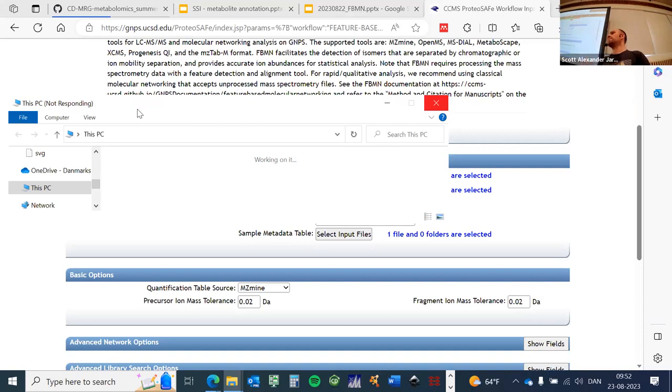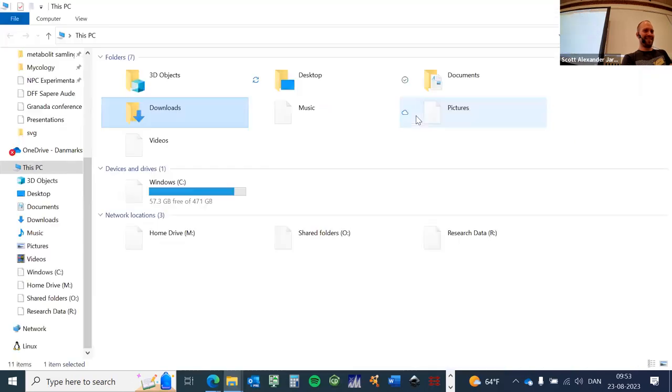If you go 2 steps back, there is a folder called metadata. I can show it in a second. Just struggling with the speed of this computer here. Apparently there are too many files on the desktop. It's a good reminder. But somehow it's loaded now.